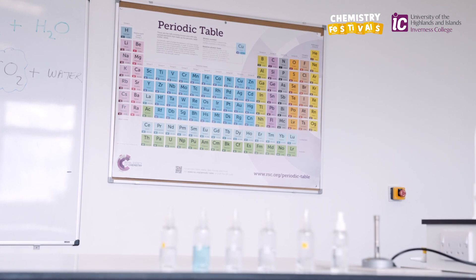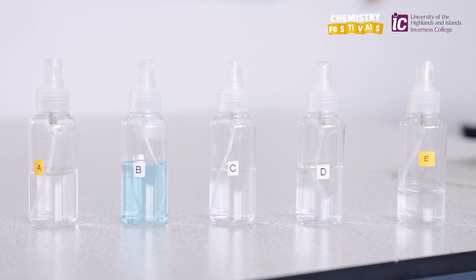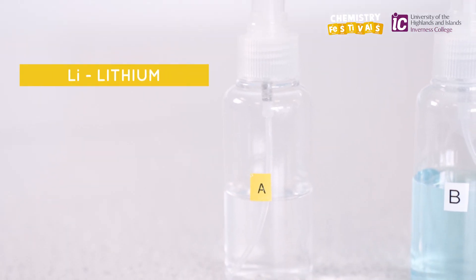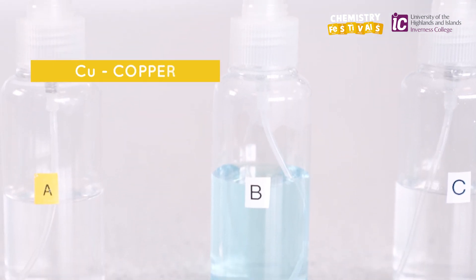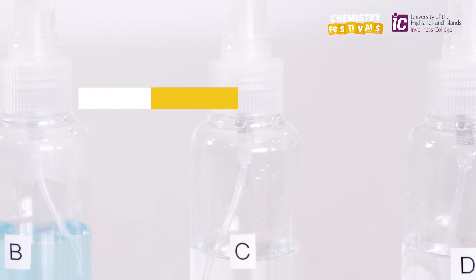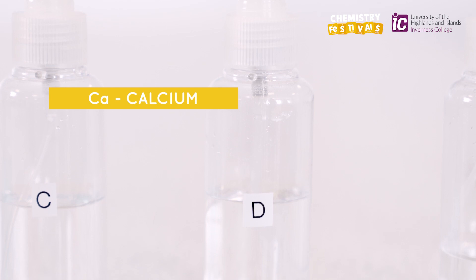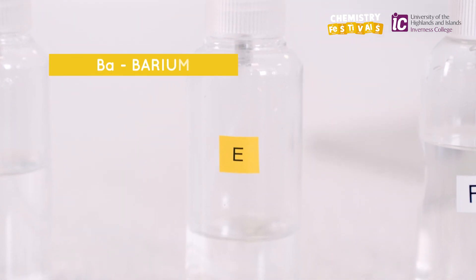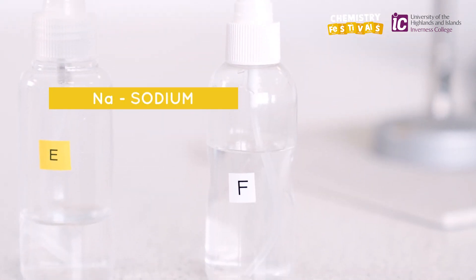In this experiment we're going to use six metals, and we've got the metals dissolved in water in these little spray bottles. Metal A is lithium, metal B is copper, metal C is potassium, metal D is calcium, metal E is barium, metal F is sodium.